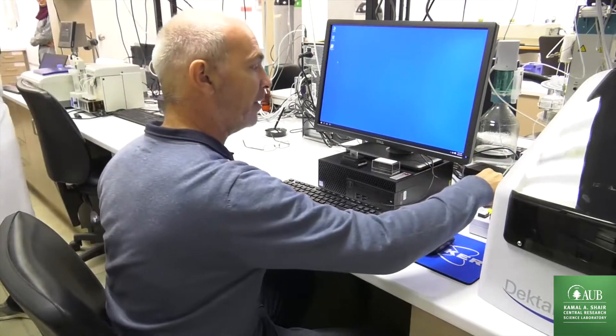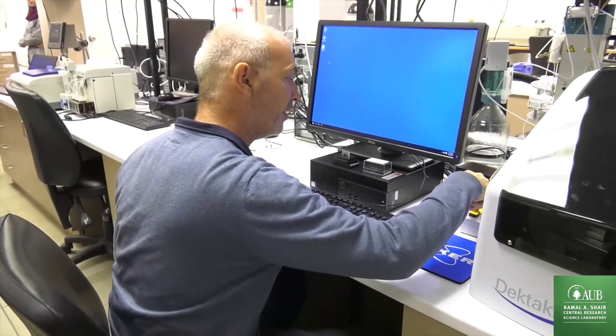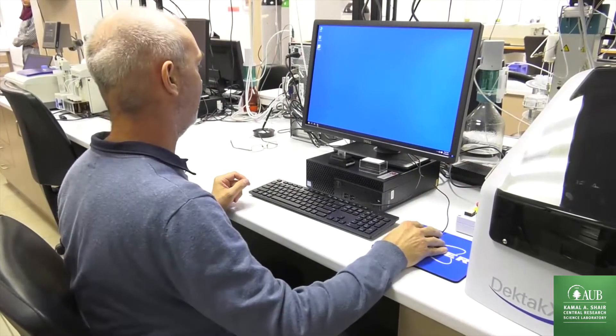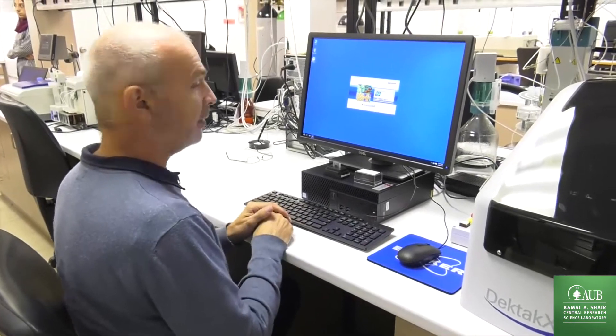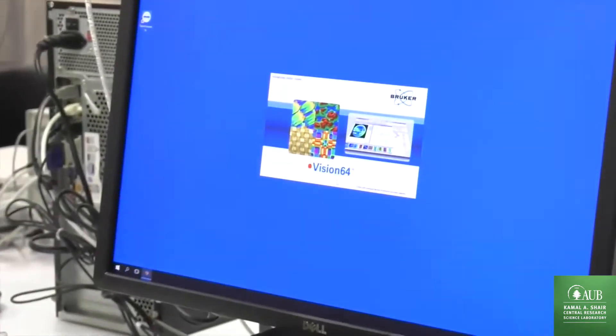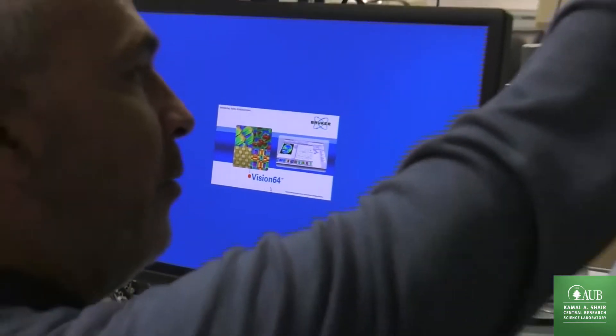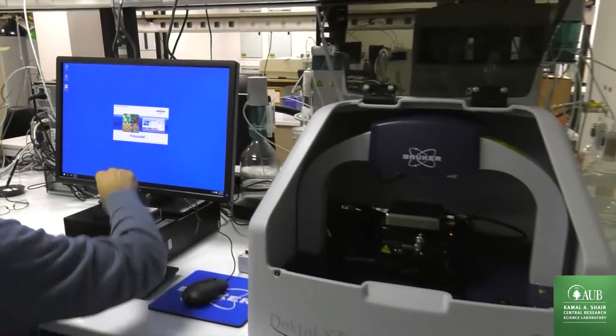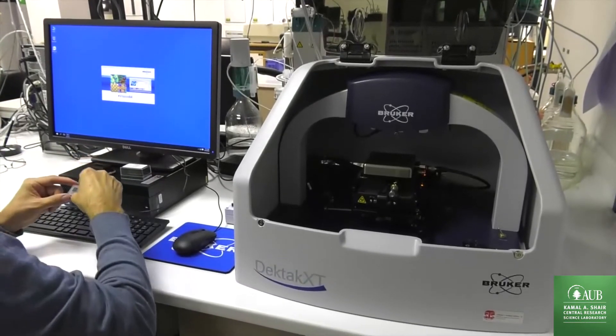We start by turning on the electricity of the system here and we start the Vision64 software. In the meantime, we can open the enclosure and place our sample.